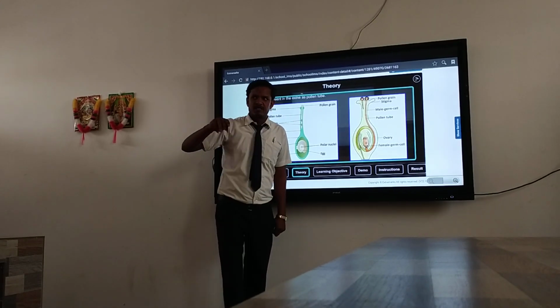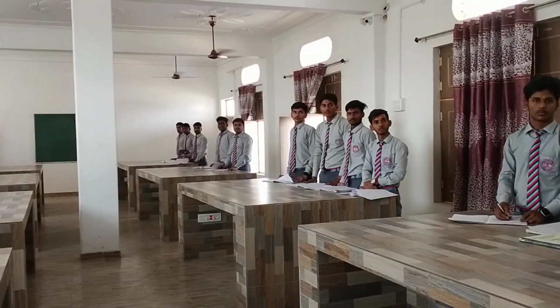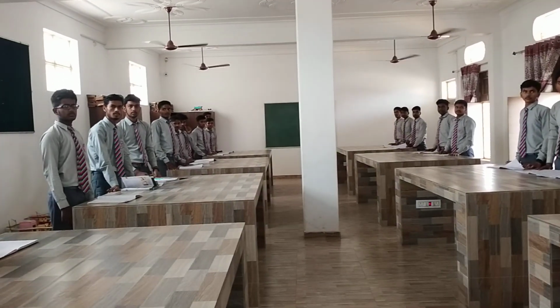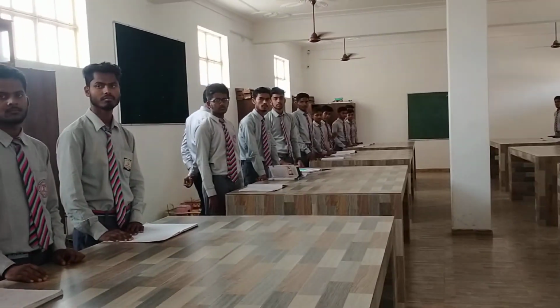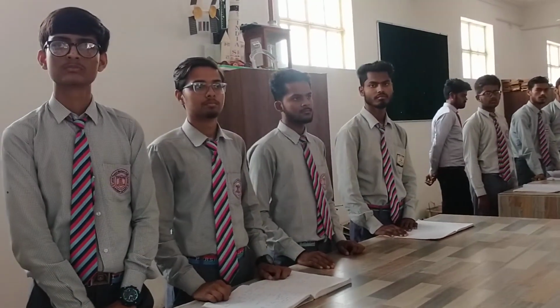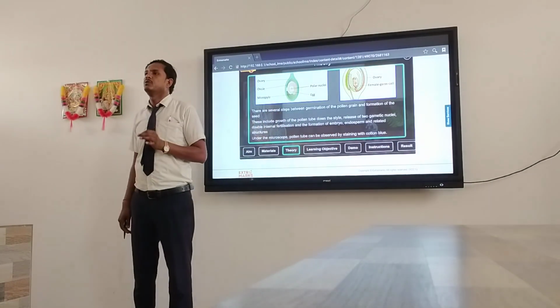One more male gamete. The steps between germination of pollen grain and formation of the seed we will discuss in the theory. These include growth of the pollen tube down the style. The style is the elongated region of the carpel. Then release of two gametic nuclei, and double fertilization. That's what you have studied in the case of angiosperms. Under the microscope, we are going to observe it by staining it with cotton blue dye.